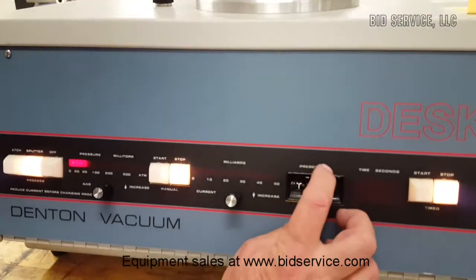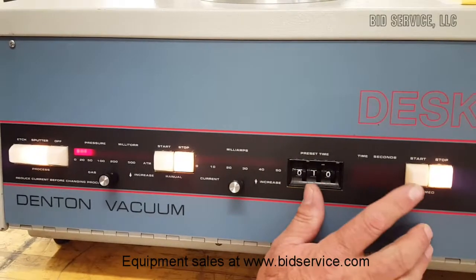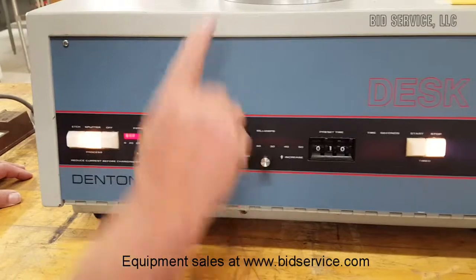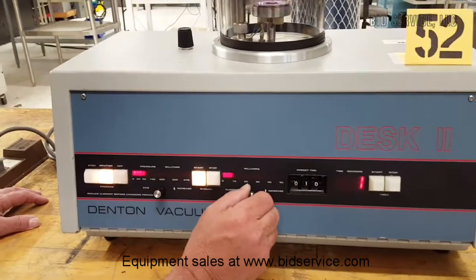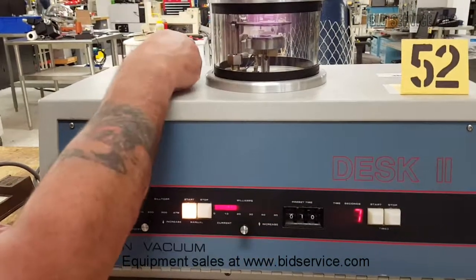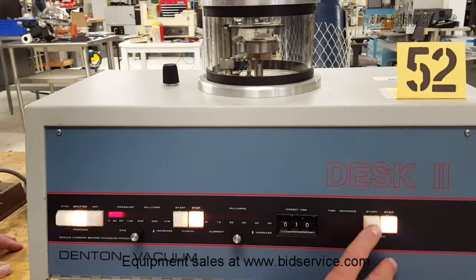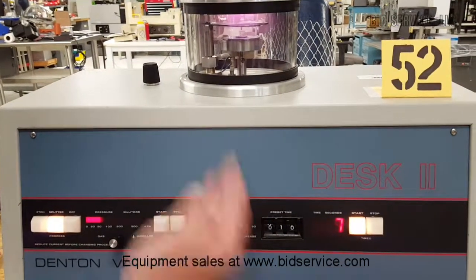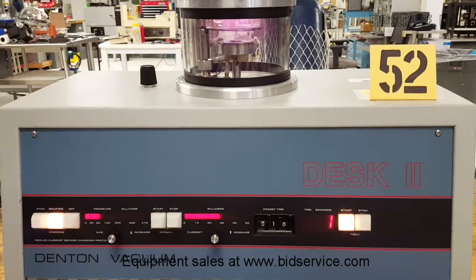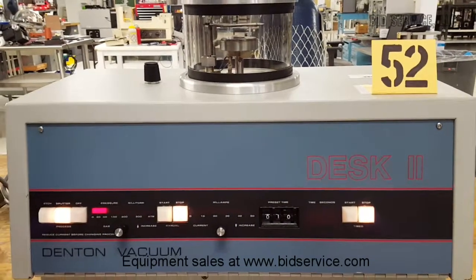I'm going to set it for 10 seconds, then hit start. I'm actually going to go to manual first just to make sure we get the current right — I'll hit manual and increase my current. Now I'm going to hit automatic, and you can see our counter is counting down. Plasma is being formed, and then at the end of the cycle it finishes.